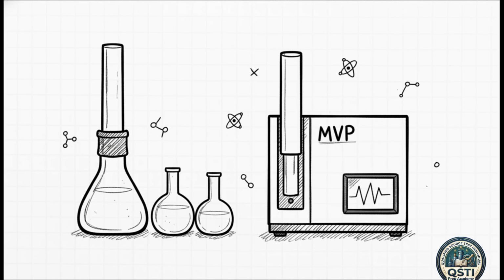Look, to achieve flawless, legally defensible chemical separations, you definitely can't just use standard kitchen gear. We need a highly specialized forensic toolkit to pull off this extraction without contaminating the evidence, right? The setup is incredibly precise. We need 125 milliliter Erlenmeyer flasks, specifically with ground glass joints, so we get a perfect airtight seal. We pair those with an air condenser to carefully boil liquids without letting any of the precious vapors escape.